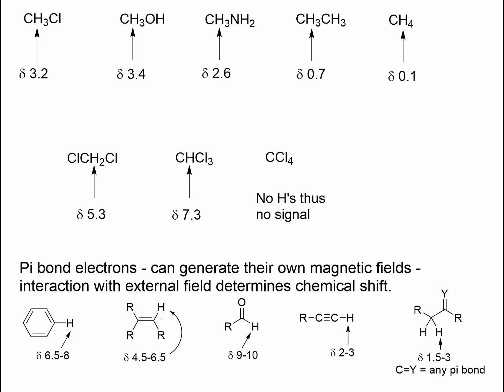Okay, so this hydrogen in both cases is attached to sp2 carbon, but the one where the sp2 carbon pi bond is to another oxygen has a much higher chemical shift. Okay, we see hydrogens at sp carbon come in a totally different range here. Okay, so these come 2 to 3 parts per million hydrogens, the hydrogen of a terminal alkyne.